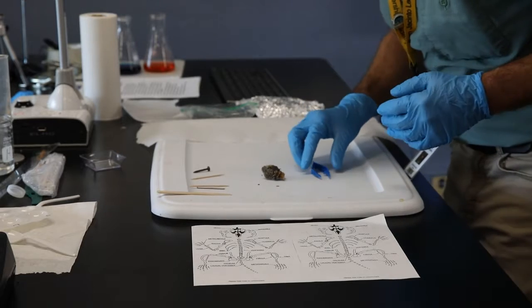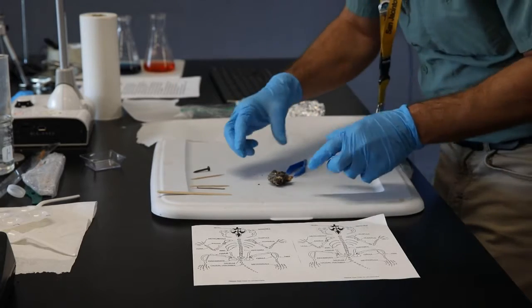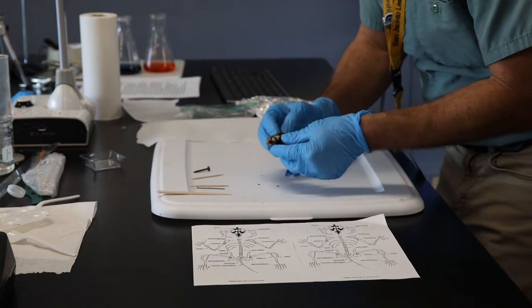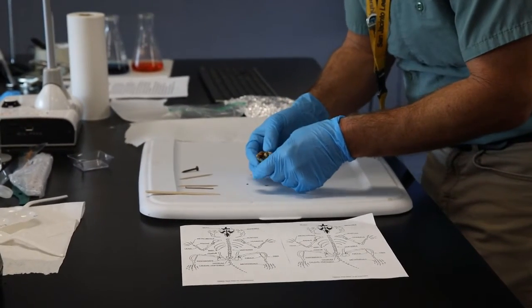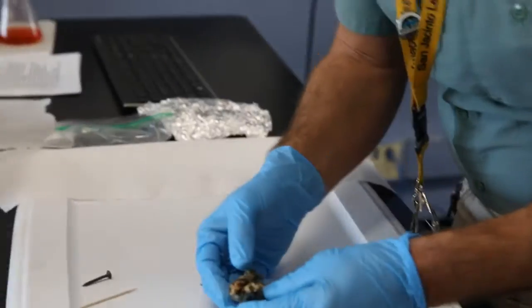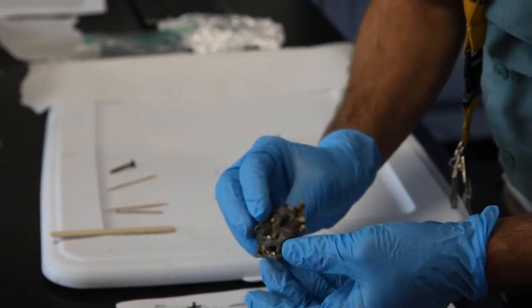Okay, Dave, dive in. I can already see the tail of whatever this thing is. Okay, so pull it apart. Cool. You have to use both hands, Dave. Open it. Let's go. Dig in here. And it's very hairy. No ketchup, no mustard, please. Oh, boy. I think I see a nose, too, actually. Oh. How close can I get to this? I'm going to move the camera in a bit. Okay, a lot closer. I don't want to miss a bone. All right, there we go. I can see like the profile of a face and a nose. I definitely can see a tail right there.